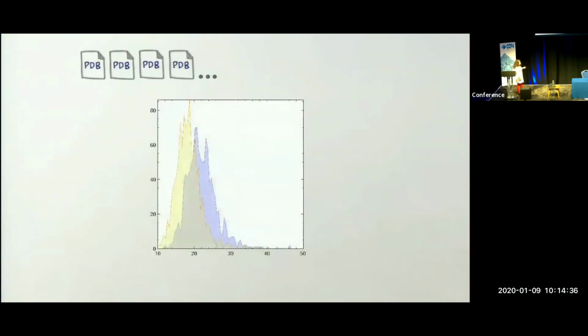So, the one thing I wanted to do was make sure that it worked across a range of structures. So I took a sample of about 1,000 almost randomly picked PDBs from the PDB, and then I'm going to show you the results from PDB-REDO so I could take the best refinement for that. So I'm going to show you the graph of the original R factors along the x-axis, and the number of PDBs with that R factor along the side, and this is split into R work and R free distributions.